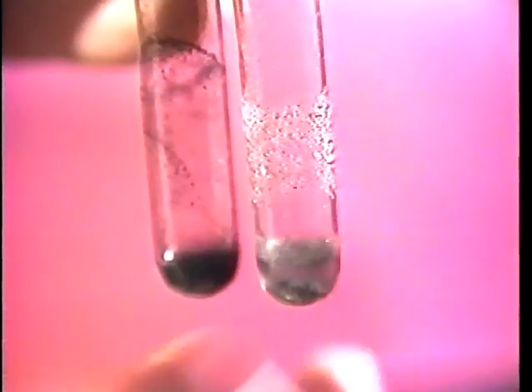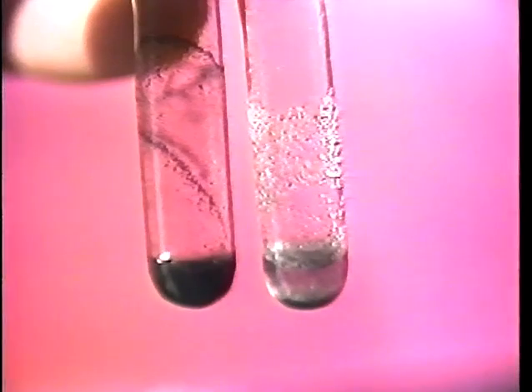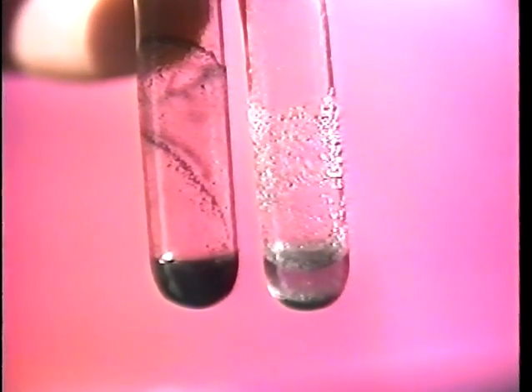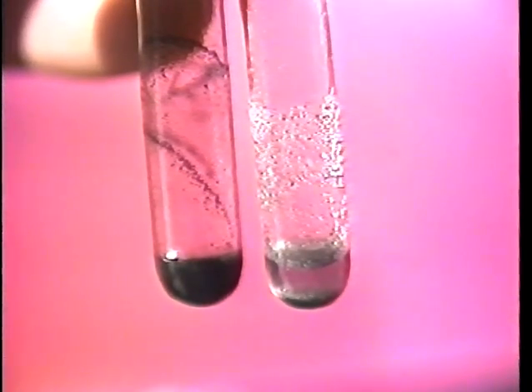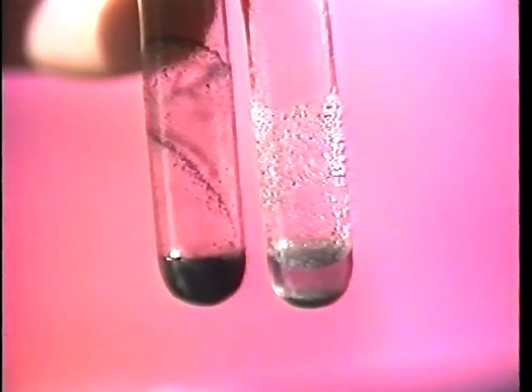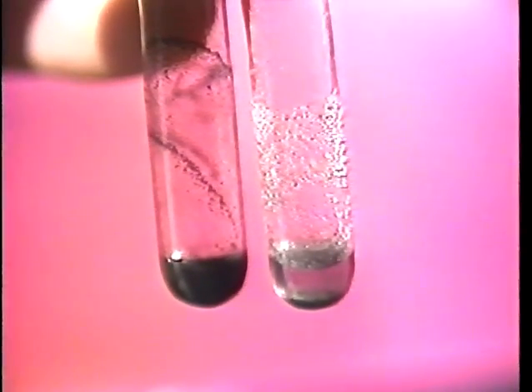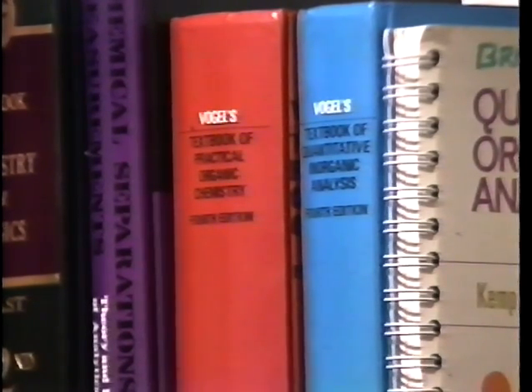In our final sample, there is an insoluble black impurity. In your preliminary test to find a suitable solvent, you will have to judge whether the soluble material has gone completely into solution. On the right is the mixture before heating, on the left after heating. Before recrystallizing the bulk of your sample, prepare a fluted filter paper as given in Vogel's textbook of practical organic chemistry.